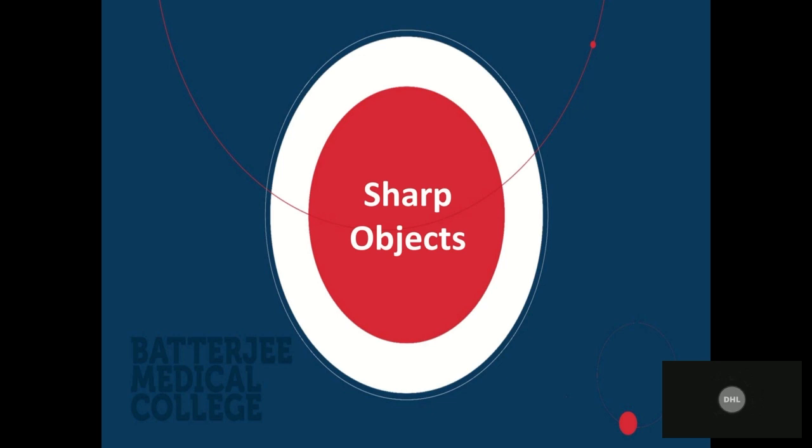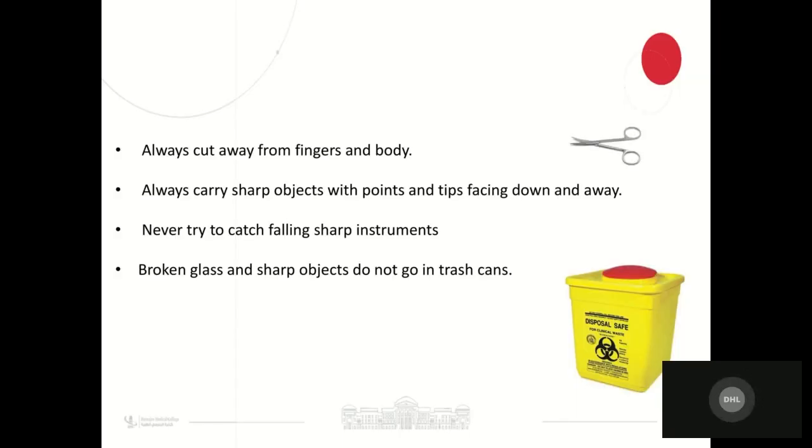Sharp objects. Always cut away from your fingers and body when you cut anything in the lab. And carry all these sharp objects point down, and never try to catch them.